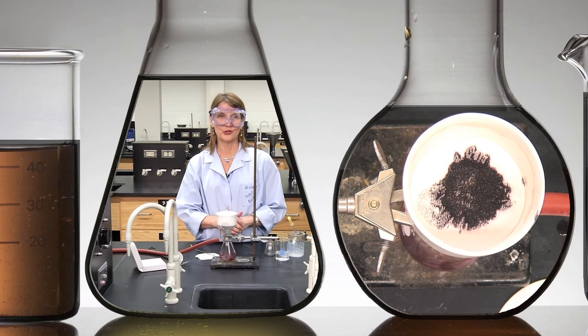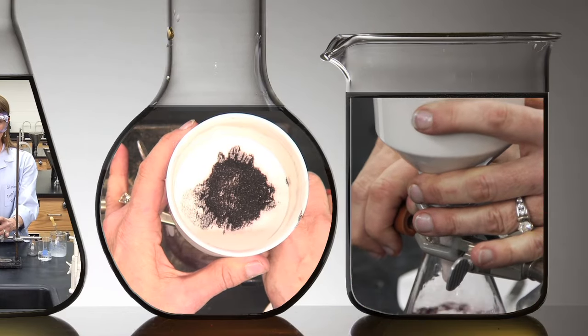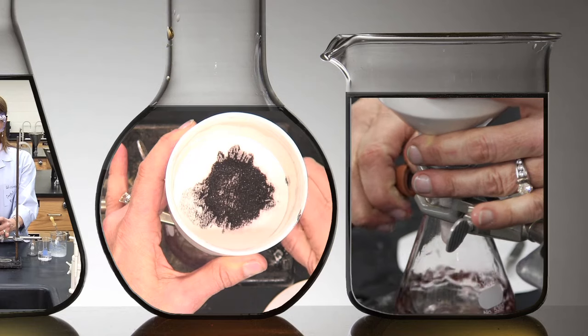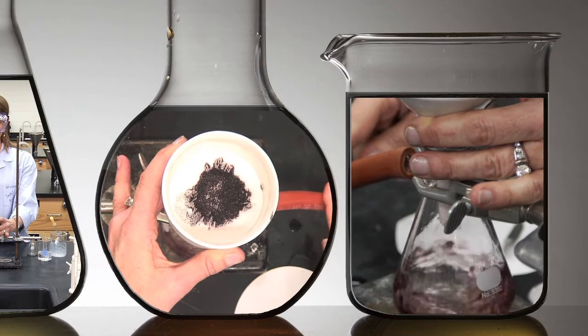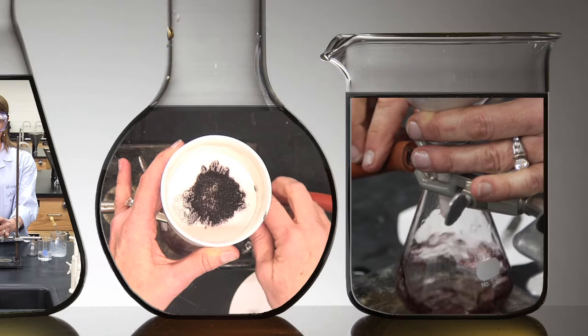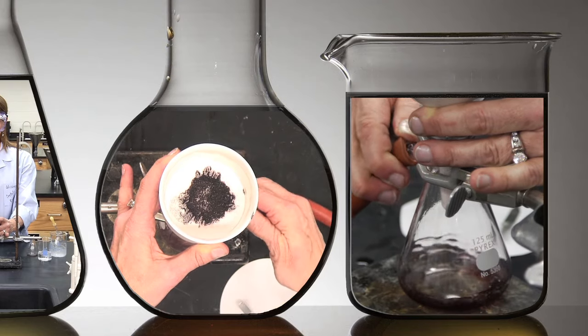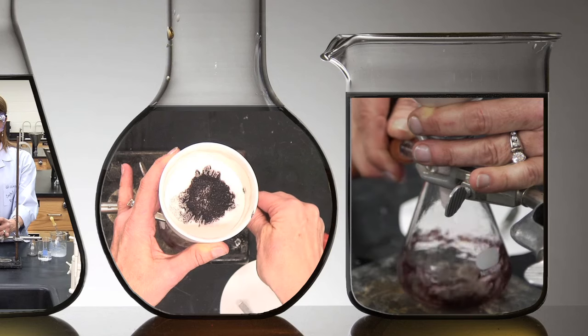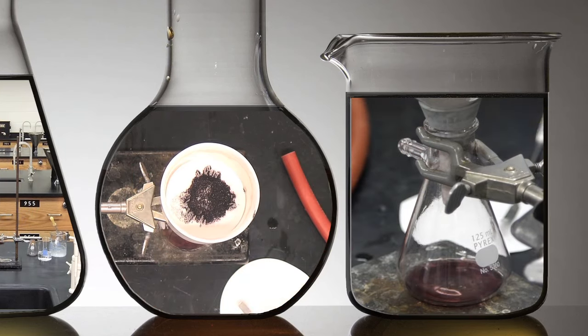After the crystals are dry, you want to release the pressure and to do this, you slowly pull the vacuum tube. Again, notice we're using thick wall tubing here, not the thin wall tubing, and release the pressure and turn off the vacuum.